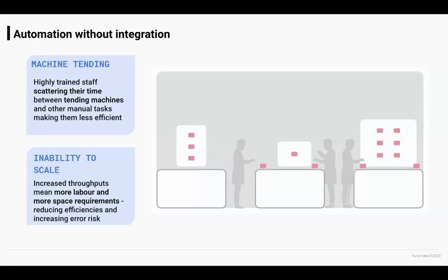And sometimes these are very inconsistent in when they happen. It's not like every hour you need to do this. You might set up your liquid handler and then in an hour you have to come back and do some machine tending, but then it might be 15 minutes and you have to come back. And the problem that I always found with this was it created something that I refer to as scientist dead time. It scatters your focus. I personally wouldn't be able to go away and do something useful in 15 minutes. Maybe that's a reflection on me, but it's difficult to get your head into something else. So it becomes dead time.